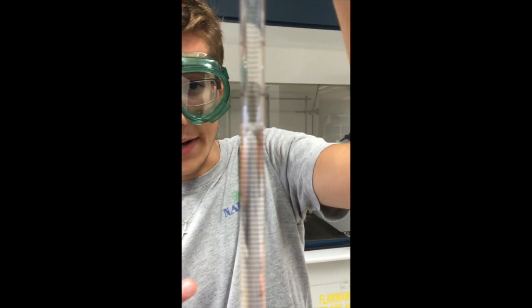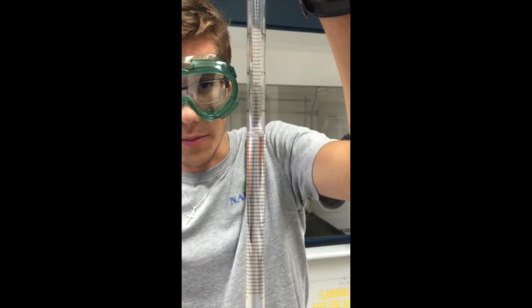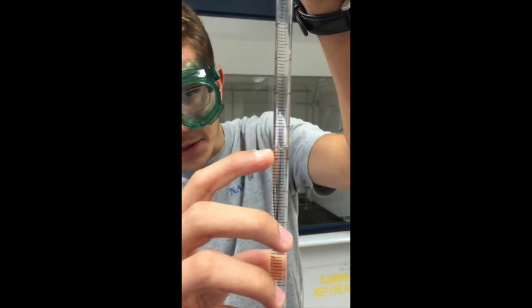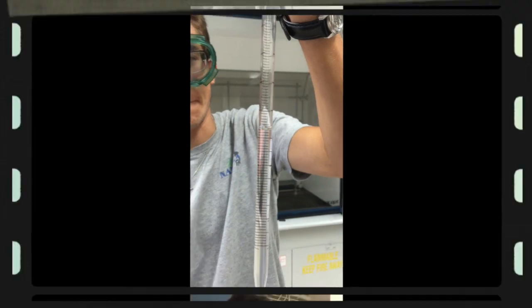meniscus. Now, as you can see here, this meniscus is kind of messing up our data, so it forms because the water molecules like to stick to the side of the glass and climb up it, forming a concave dip. But to get past that, we always read from the bottom of the concave dip. So as you can see here, this would be at 6.3 milliliters.